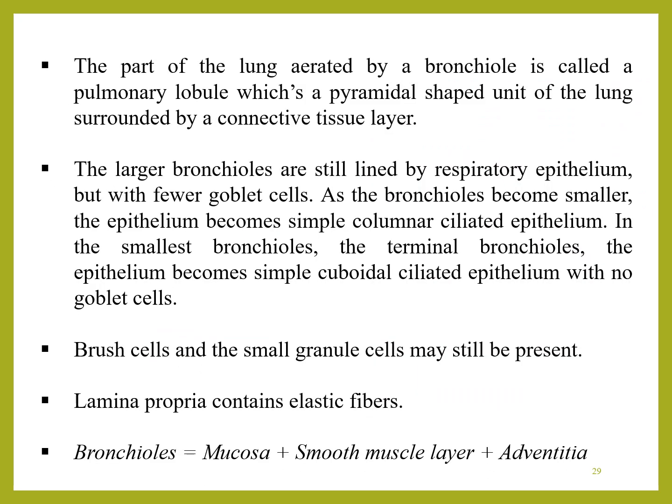Now, the part of the lung aerated by a bronchiole is called the pulmonary lobule. So all the region of the lung into which a bronchiole conducts air, this is called pulmonary lobule. It is pyramidal in shape and it is surrounded by connective tissue.